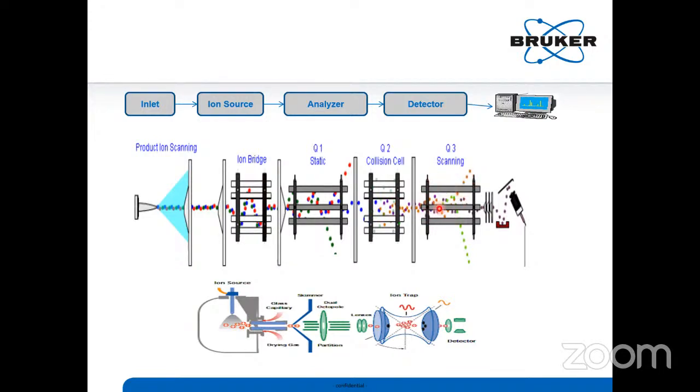Here, you are confirming MS, and at the same time, at the fragmentation level, you are confirming MSMS. It means your confidence level when you say only MS-level compound mass, and MSMS-level compound mass, will be completely different. The same criteria apply when you come to ion trap. In an ion trap, you don't have 3 compartments or 2 compartments. In an ion trap, you will have only a 3D mode, a single compartment where both MS and MSMS happen.